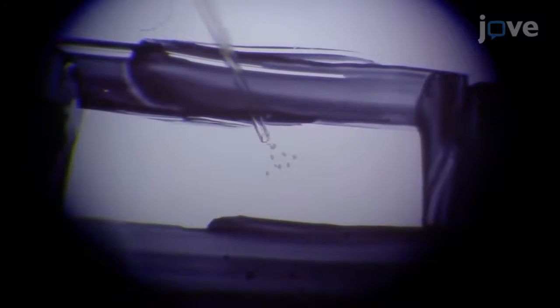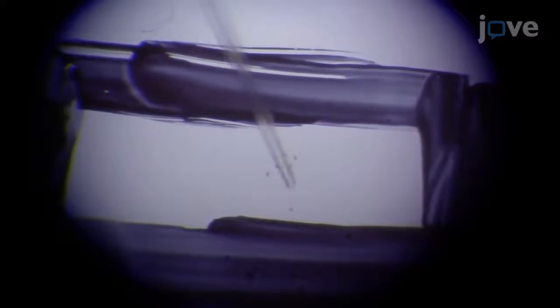Dispense the embryos into the central rectangle of the coverslip of a steel imaging chamber filled with fresh M9 buffer. Gently orient the embryos vertically so that the long axis of each embryo is perpendicular to the long axis of the coverslip.